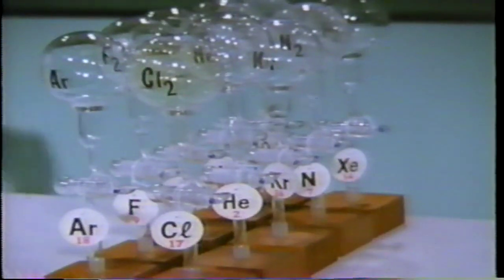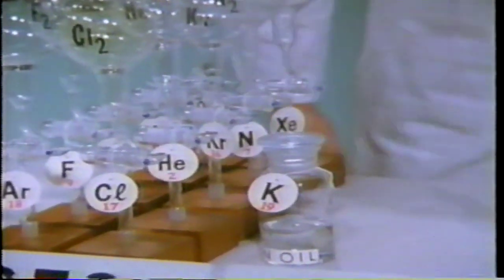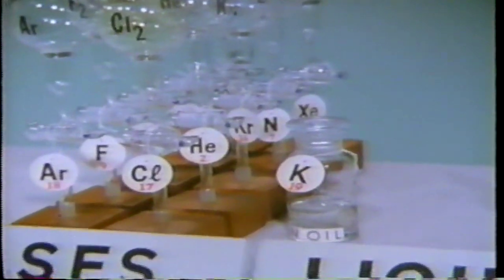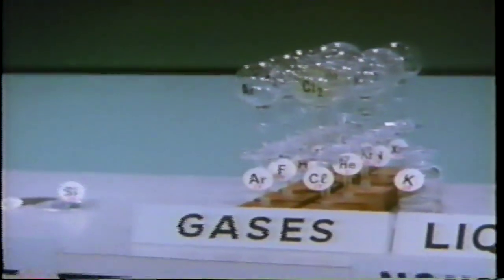Can these gases be further classified on the basis of their chemical reactions? Potassium, we observed earlier, reacted with air. Since air contains several gaseous elements, let's see which of the gaseous elements will react with potassium. This system of glass bulbs and stopcocks allows control of the flow of the gases we wish to test.